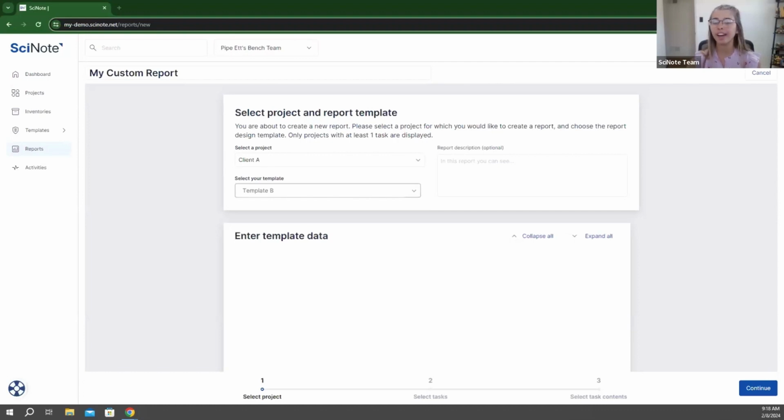I know I went over that a little bit fast, but just as a reminder, you can add your questions to the chat, to our Q&A, or raise your hand, or you can even email us after the webinar as well. And we'd be happy to help regarding those, because just like custom development, everything is custom and specific. So not one of these options or solutions we talk about today might fit your team, because that was unique to this specific team. And we all know that you are all different.